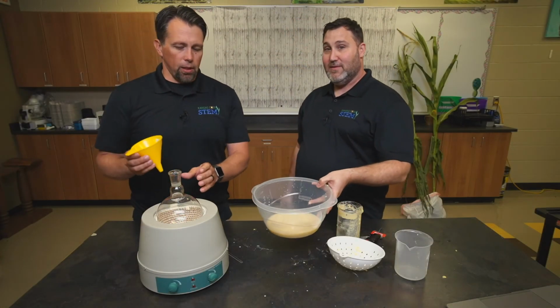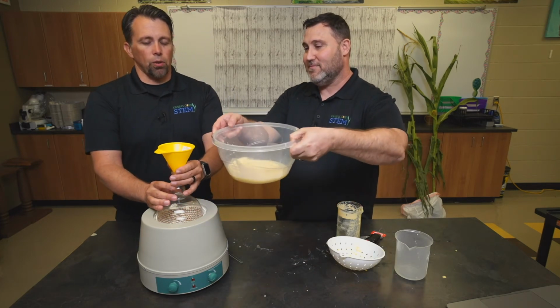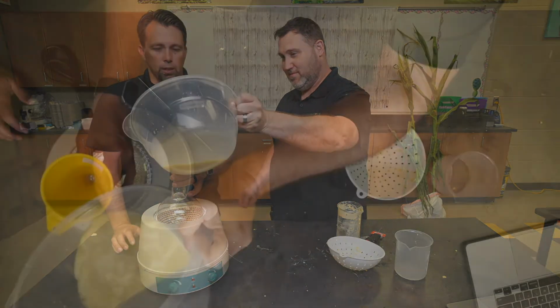So now we've completed filtering our sample. We're going to use a funnel and pour it into our distillation flask.